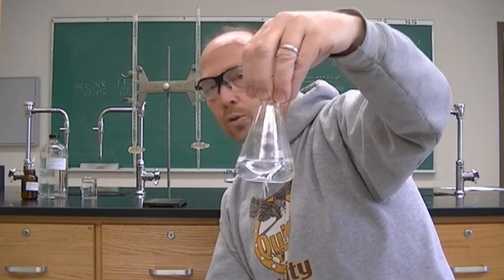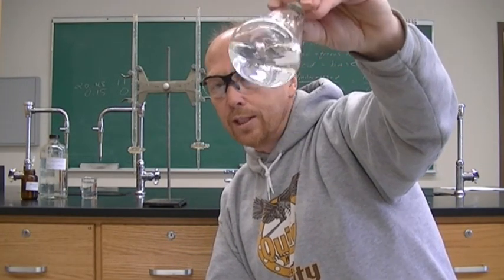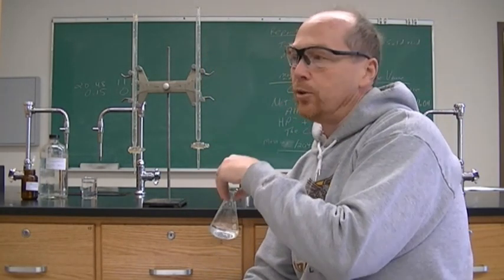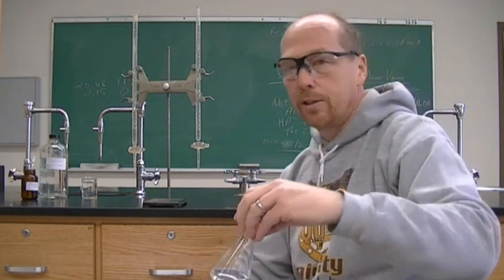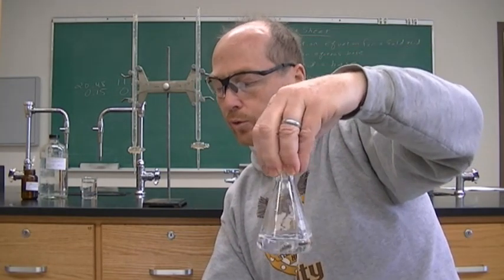So this is an acid solution. KHP, again, is a monoprotic acid. All right, and so we're going to add our base from our burette, and it's going to turn a light pink because I added the 5 drops of phenolphthalein. And you will know if you did not add the drops of phenolphthalein because it will never turn pink. You should know this right away. As soon as a drop hits, you're going to see some pink. Maybe not on the camera, but I will see some pink, so I know that the phenolphthalein is in there. All right, so we are ready to do this titration.